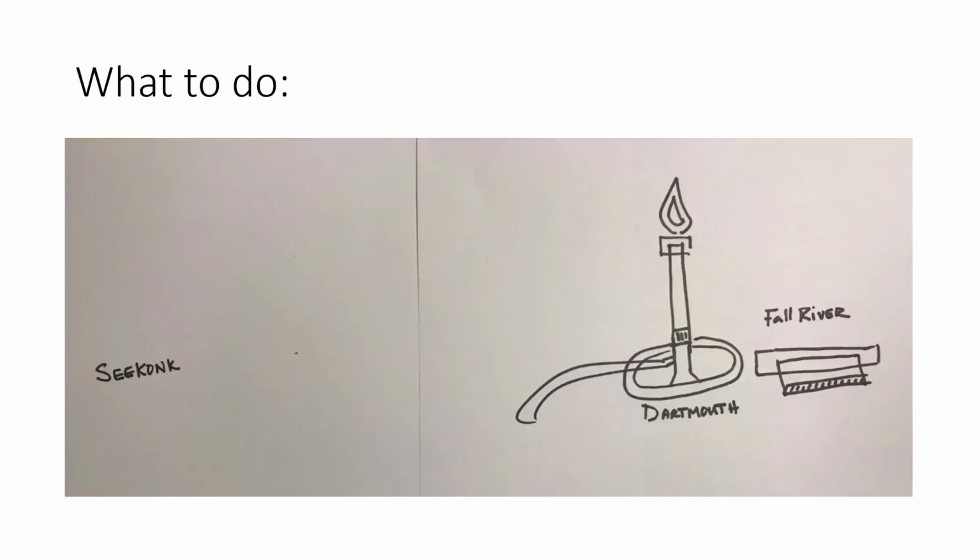Now, I wanted you to have the true experience of being in one of my classes. You get to see some bad Foster art here, but hopefully you can get the idea of what I'm trying to explain. So what we would do is we would label a petri dish for this experiment. We would put where the isolate comes from, probably our initials, what type of medium we're streaking onto, growth temperature, the usual things that we've already talked about in a previous lab.